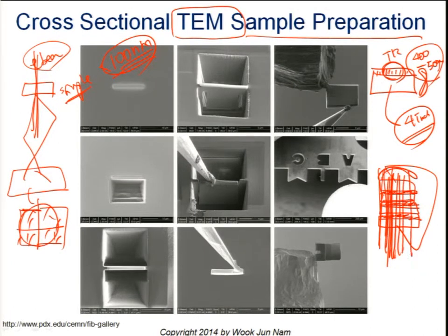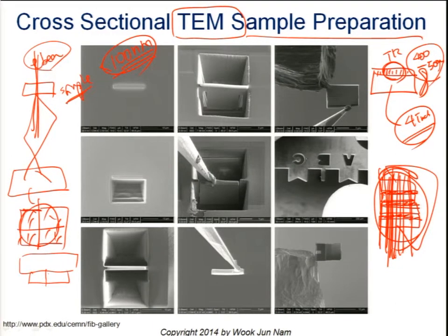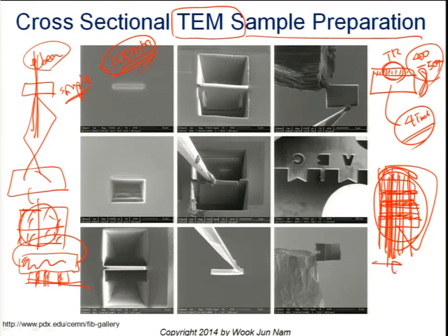We put these sandwich-like structures onto a bigger dummy structure, grab it, and using sandpaper, polish this stack in these directions as thin as possible.